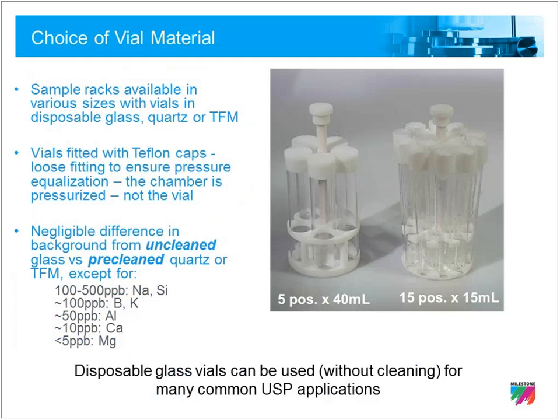The only exception that I would make to that is for your common environmental contaminants: sodium, calcium, aluminum, potassium, certainly silica. These elements can be found at some level, so really it's ensuring that your detection needs can withstand these background levels, and if so, glass would be available to you as well. If not, quartz would certainly also be a viable option.